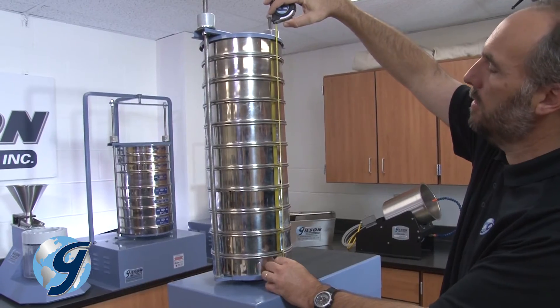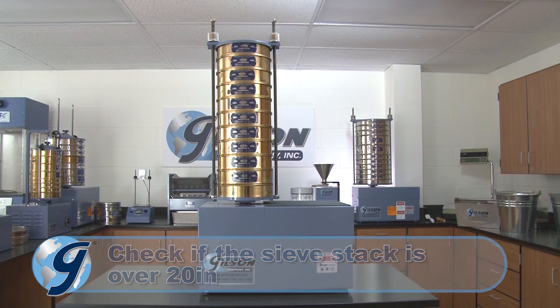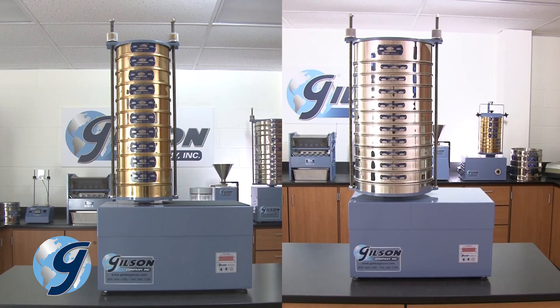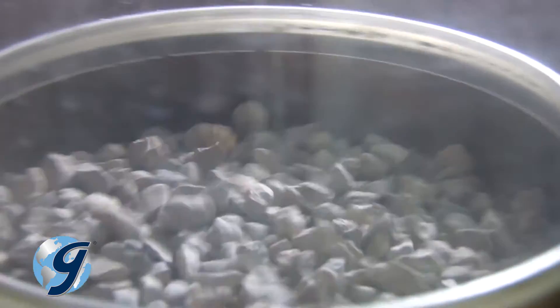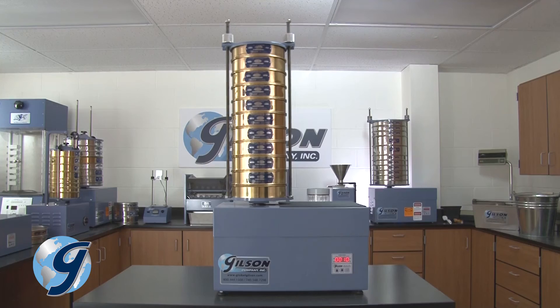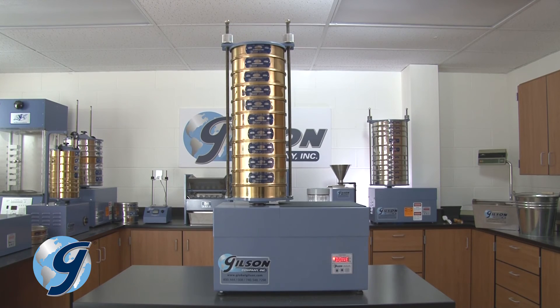Check if the sieve stack is over 20 inches. The Gilson SS-8R and SS-12R sieve shakers are counterbalanced to permit freestanding operation with most common particle sizing. But with very tall sieve stacks, the unit may move around during operation. Normally, this condition occurs only with sieve stacks exceeding 20 inches in height.